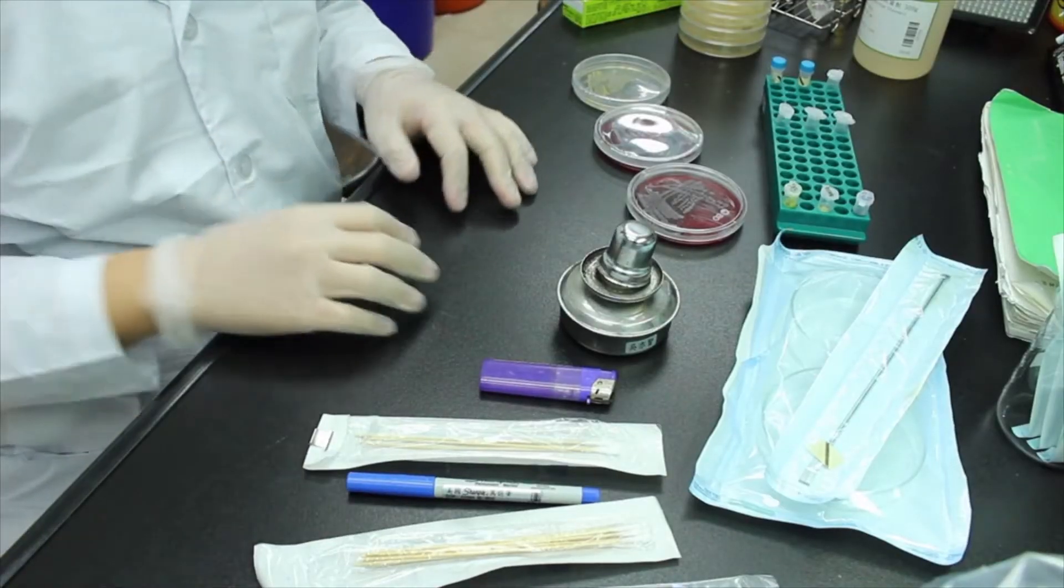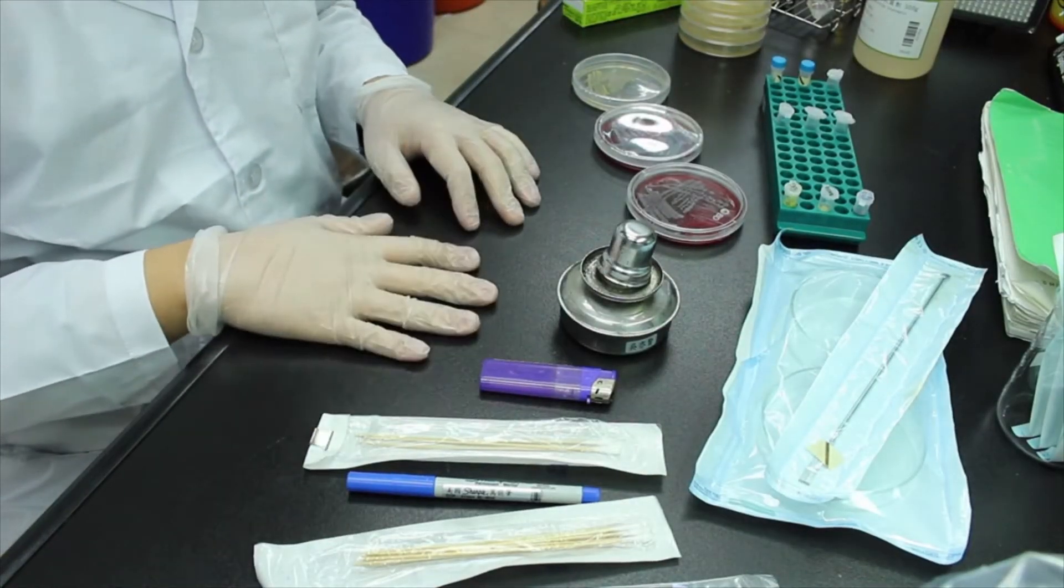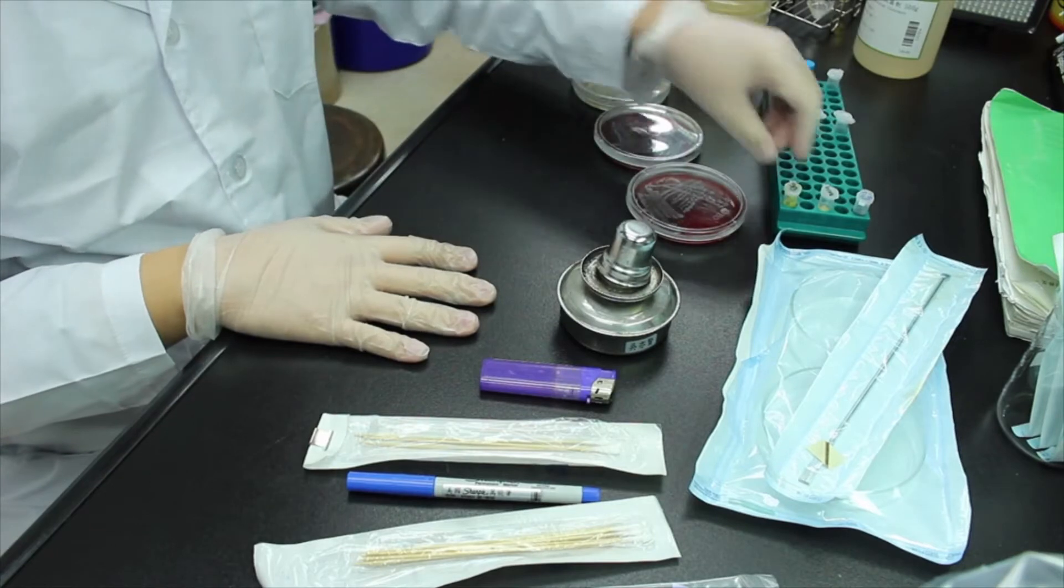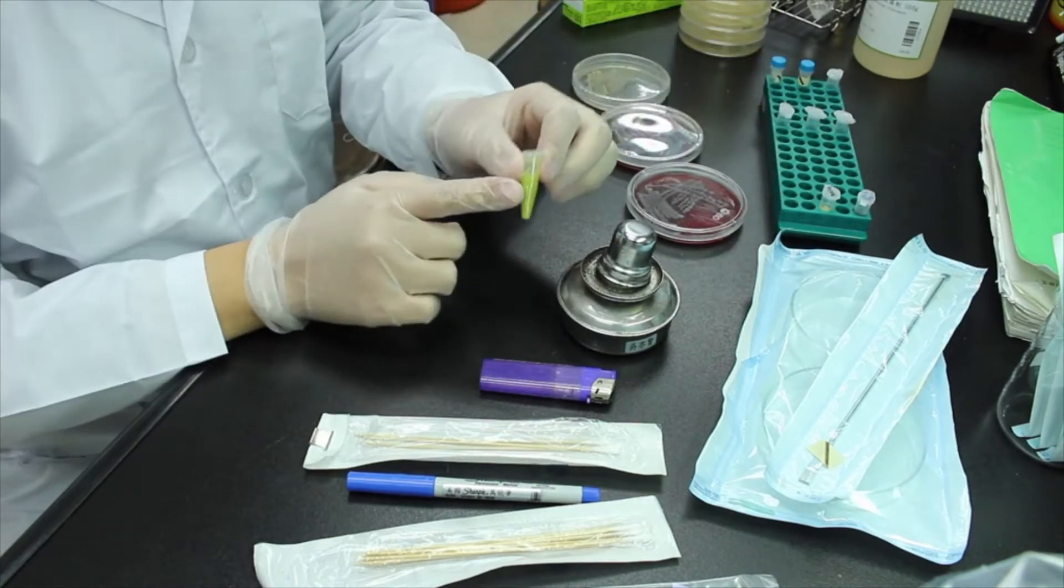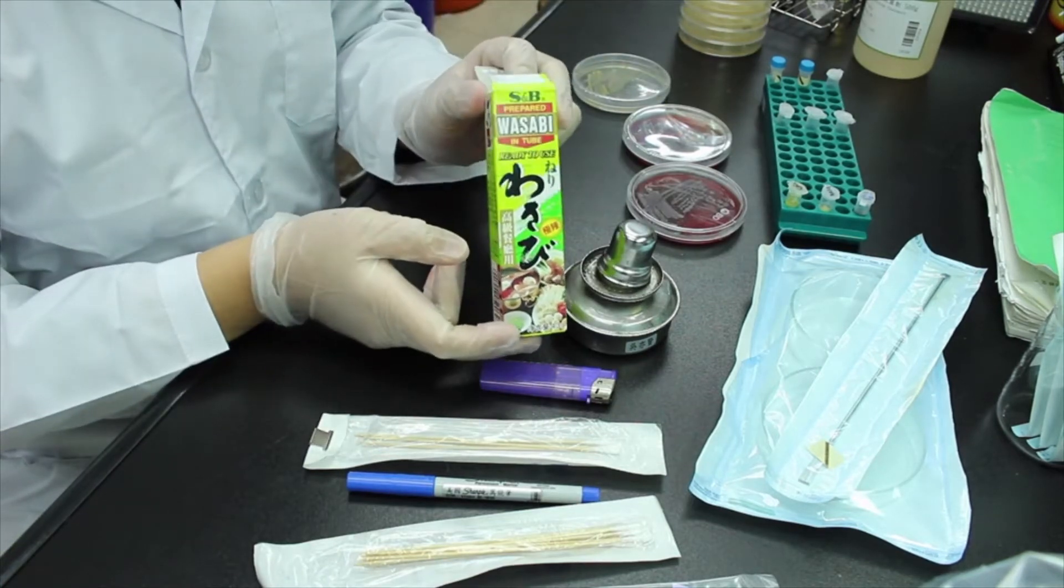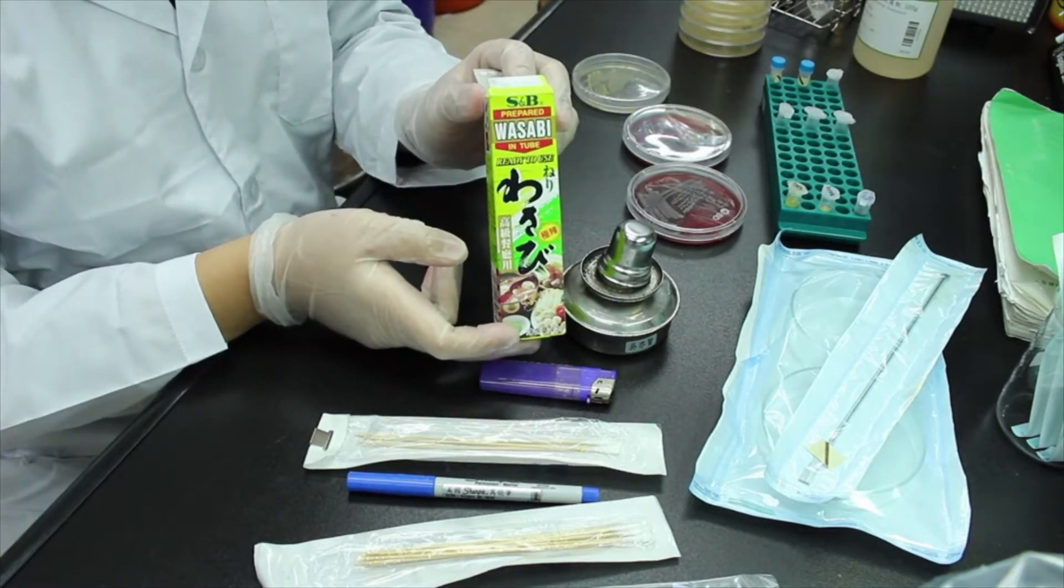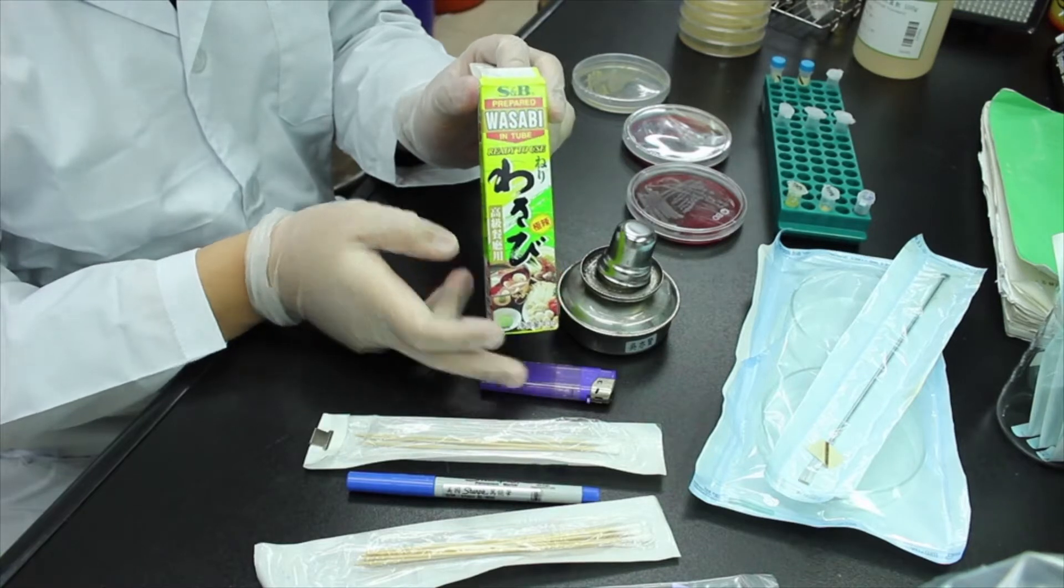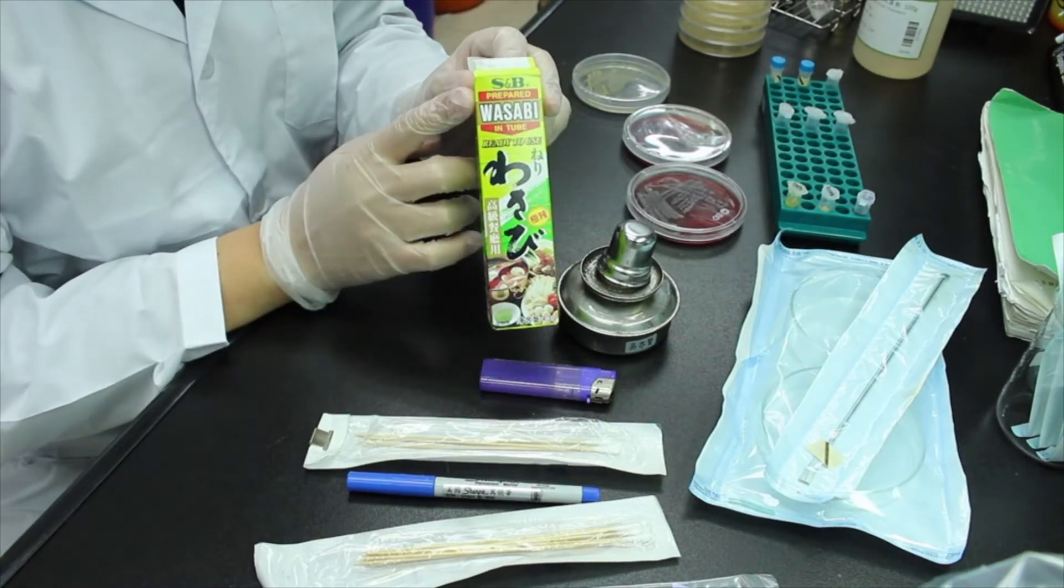Here I prepare some material for testing. First is the wasabi sauce. It is made by S&B, which is a Japanese brand. It is not made of real wasabi but another species of plant and adds wasabi flavor and food color. This is normally used as a cheap alternative.